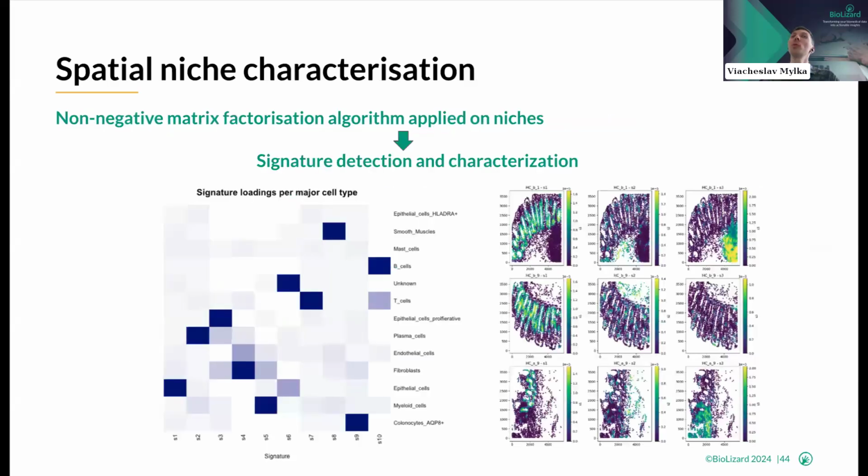So I already mentioned before that we apply dimensionality reduction onto single cell dataset and spatial transcriptomics dataset. Actually, it's ironic that we researchers were striving for more genes, more samples in one experiment. And we reached the stage where the data became so complex that we need to apply these approaches to simplify again and to be able to answer biological questions.